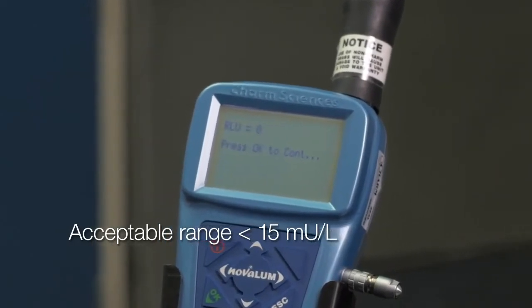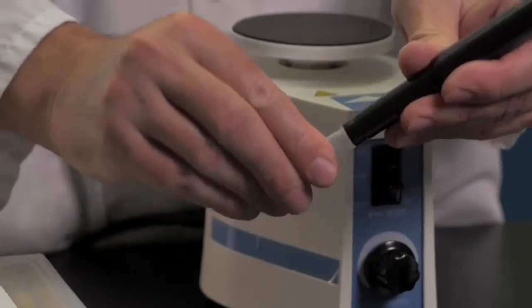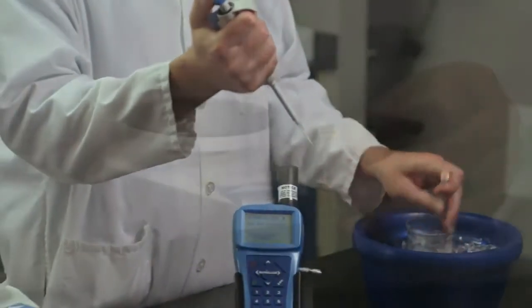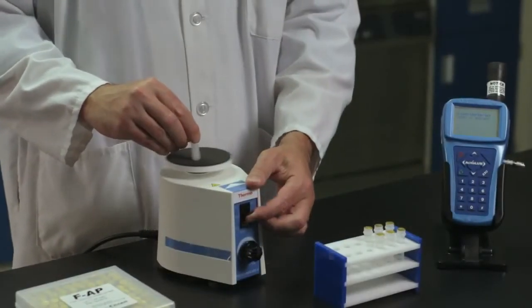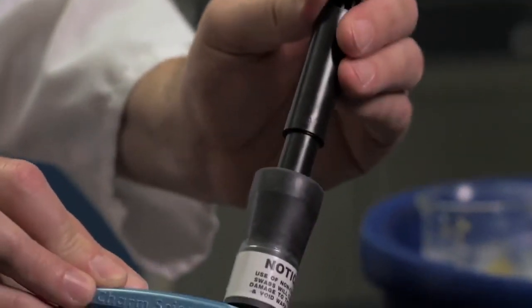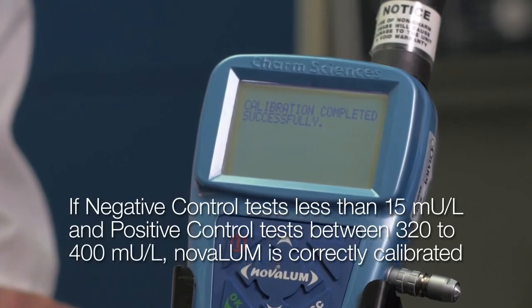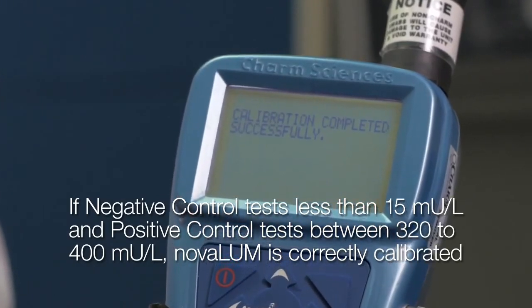In our demonstration, a result of 0 mU per liter is now shown for the negative calibrator. Press OK and the Novolume will prompt you to retest the 350 calibrator. Pipette into the FAP vial, press OK, mix with the Vortex mixer, attach the adapter and insert it into the Novolume. Here we receive a result of 395 mU per liter for the positive calibrator. Press OK. If the negative control tests less than 15 mU per liter and the positive control tests between 320 to 400 mU per liter, the Novolume is correctly calibrated and the screen will read calibration successful.